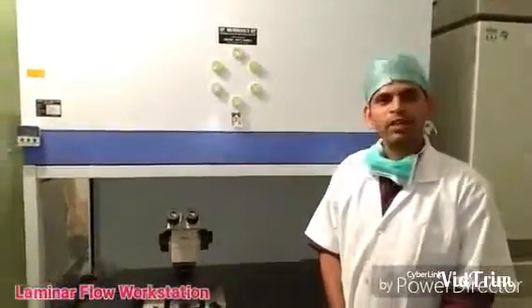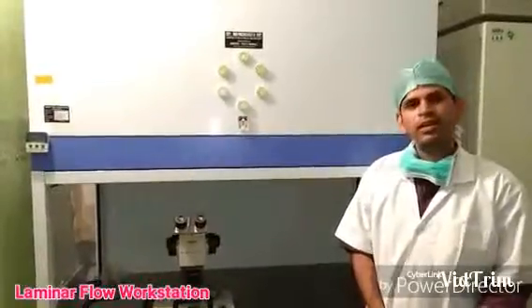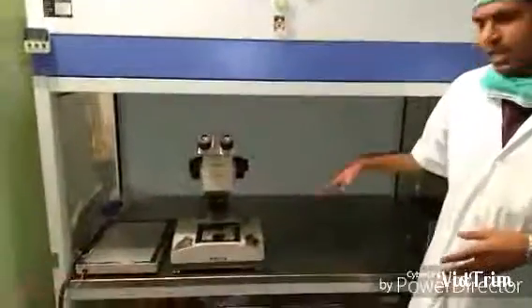Hello, in this video I am going to explain about the Laminar Flow cabinet. The Laminar Flow cabinet is a working desk of an embryologist, and we perform most of our procedures under this cabinet.